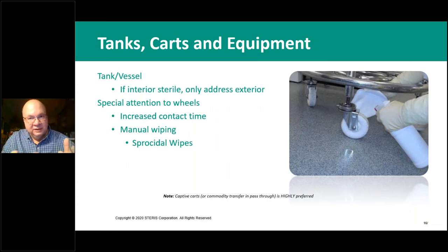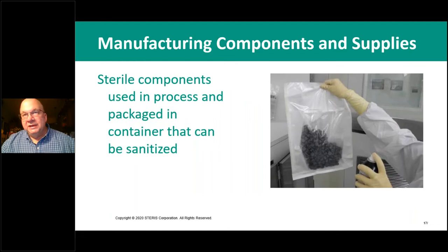We even have one clean room, a big clean room facility, where they built little troughs in the pass-through, and the wheel goes and sits in the trough surrounded 360 degrees by sporicide for 15 to 20 minutes. Spraying down any plastic bags you're coming in with sporicide is a good practice.